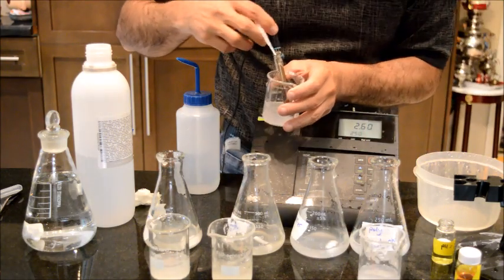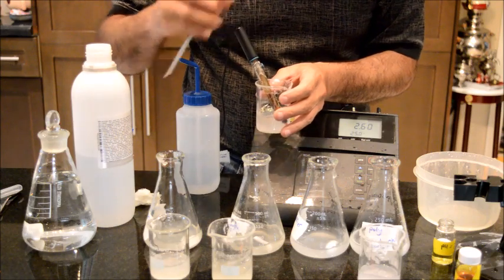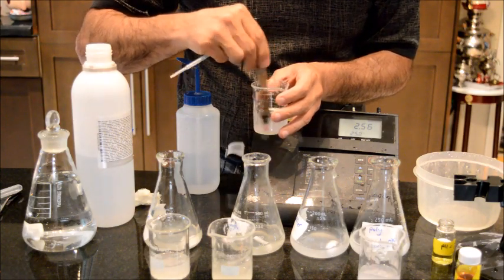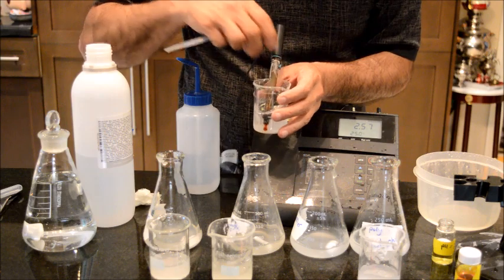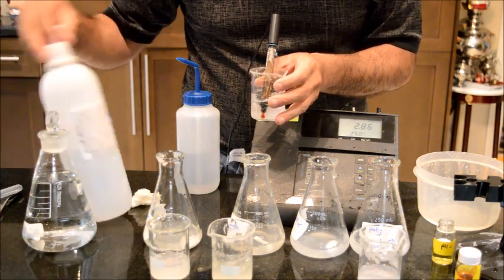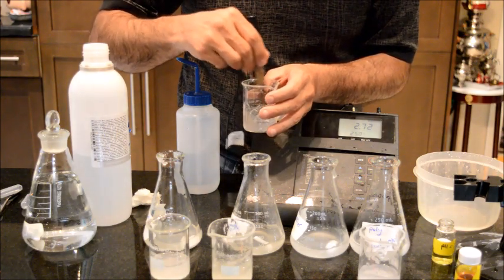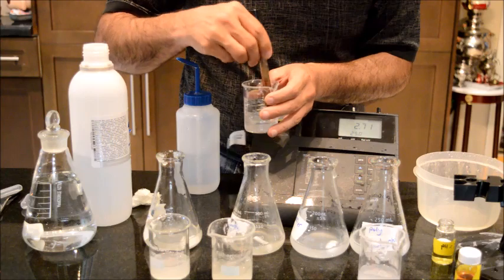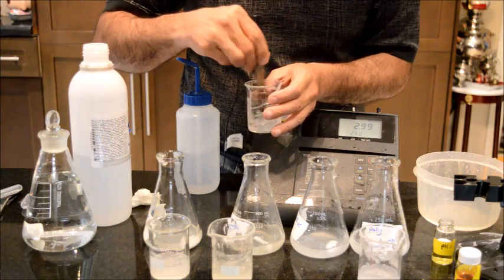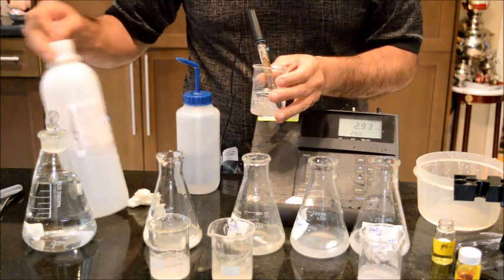Lift this up, get it closer to myself. It's easier to work. It's not there yet. And as the pH of the Carbomer rises, it actually becomes transparent, very, very nice.